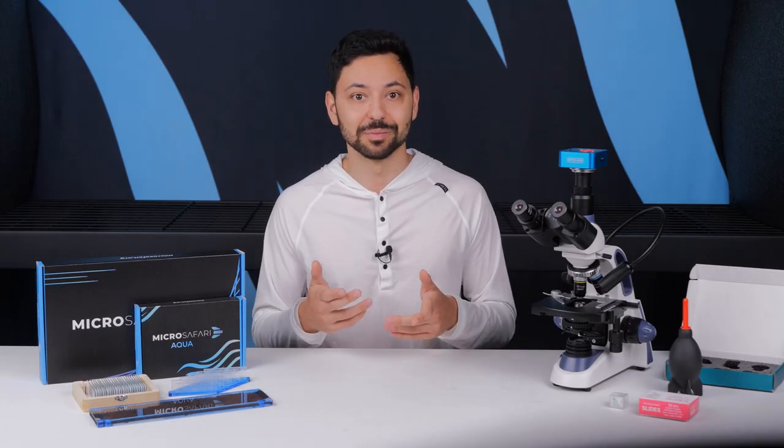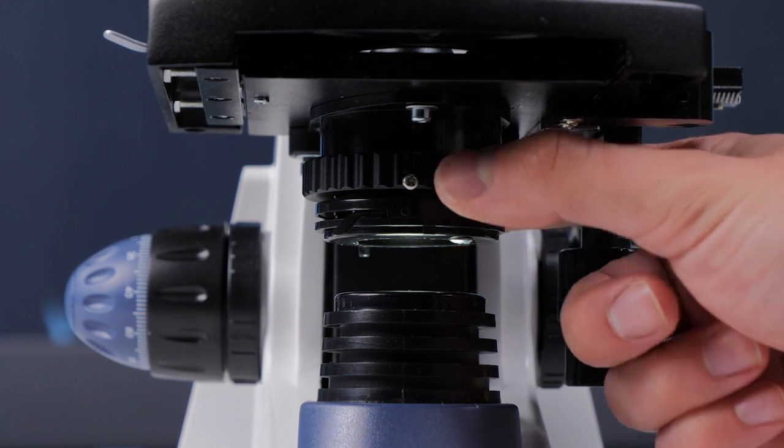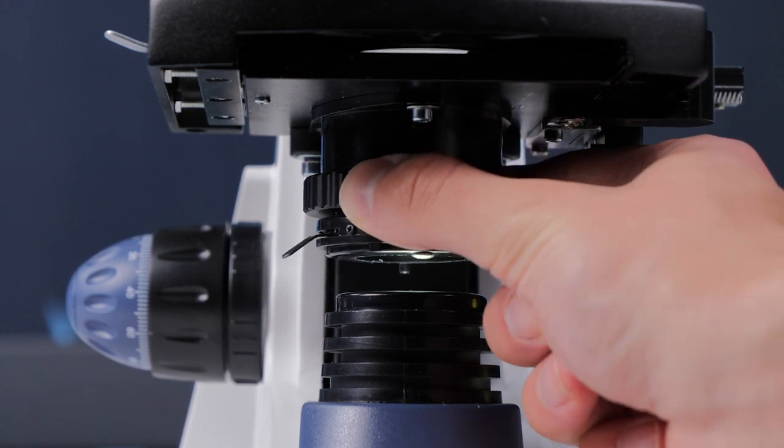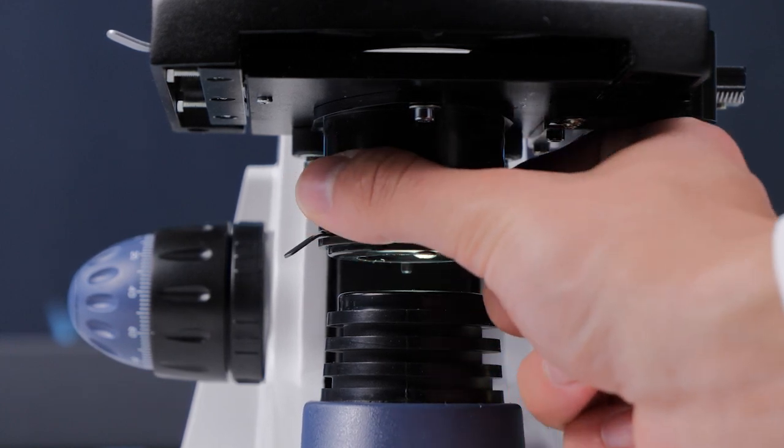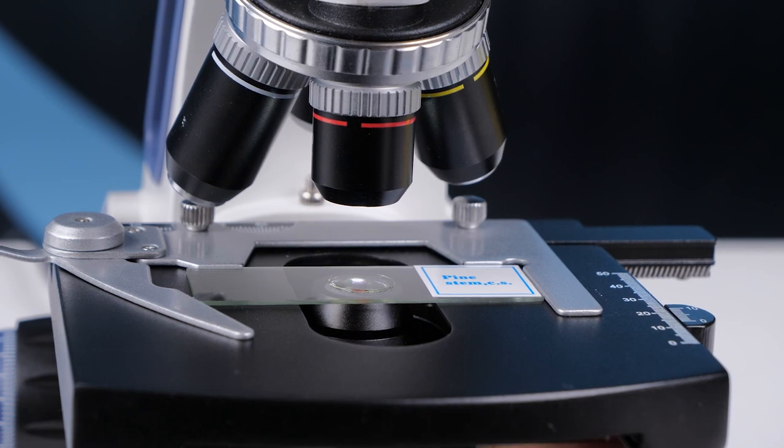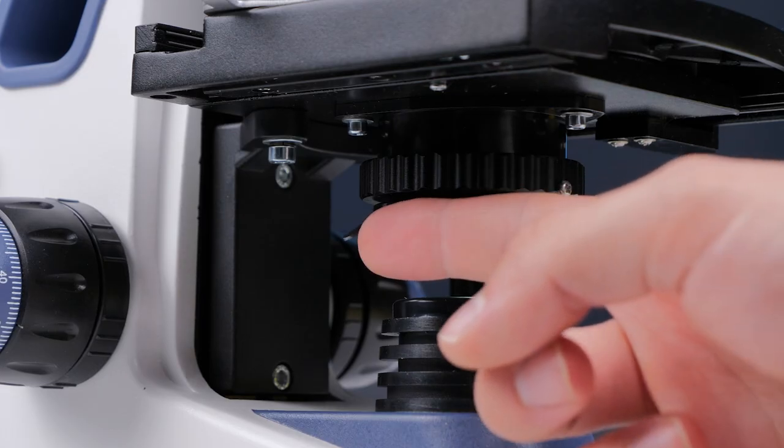Moving on to optimizing the illumination. If you rotate the knurled area of the condenser it'll move the whole condenser up or down. You'll almost always want to have it all the way up. Then on the side you have the iris adjustment lever.